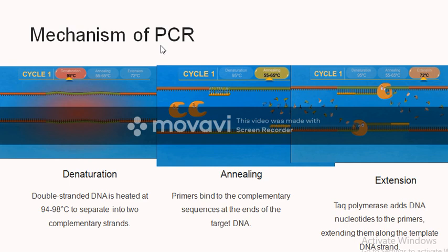The second one is the annealing process. In the annealing process, the primer binds to the DNA strand.